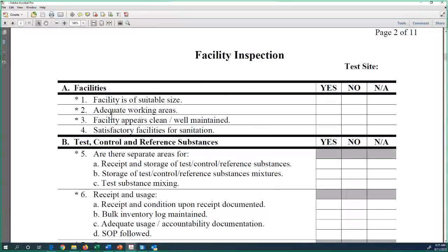Okay, the working area. Typically, the standards and the extraction should be separated. That does not mean it's a separate room. It can be a room, but a separate place. If you make separate rooms, that's great. You prepare standards in one room, you do the extraction in another room and do analysis in another room.